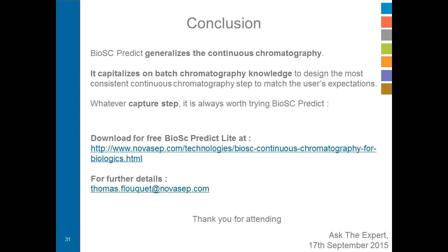And what is the difference between the light version and the non-light version? On the light version, you have only one scenario available. You can't play with all the parameters compared to the non-light version, where you can. I was showing the non-light version.